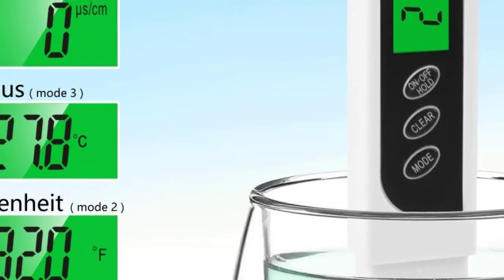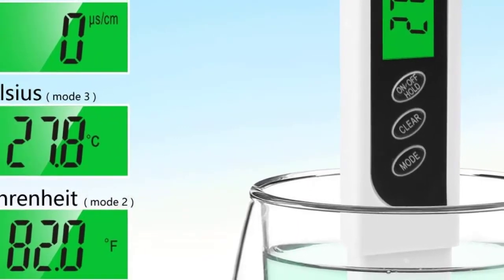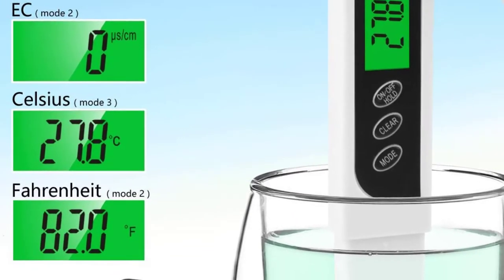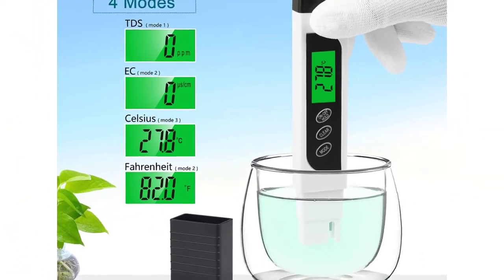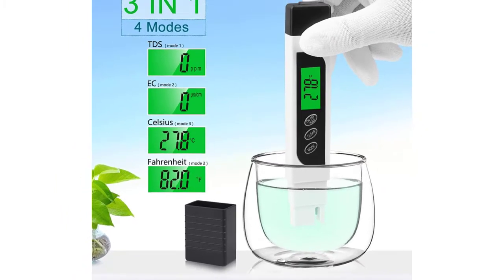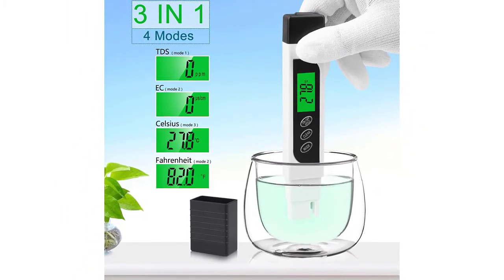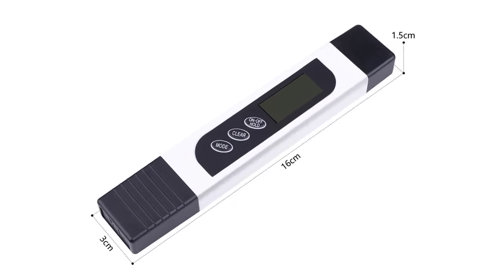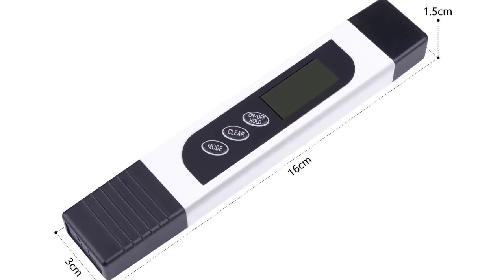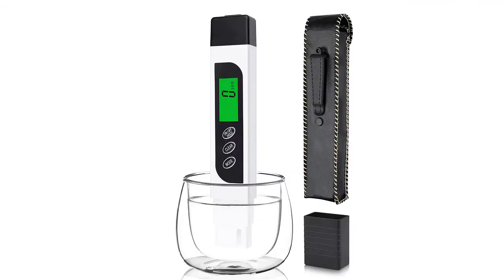The measurement range is 0–9,990 parts per million. From 0–999 PPM, the resolution is in increments of 1 part per million. From 1,000–9,990 PPM, the resolution is in increments of 10 parts per million, indicated by a blinking X10 indicator. It has a translucent blue housing that's very strong and durable. TDS Easy Meters are calibrated with a 342 PPM NaCl solution and can be recalibrated with a mini screwdriver.